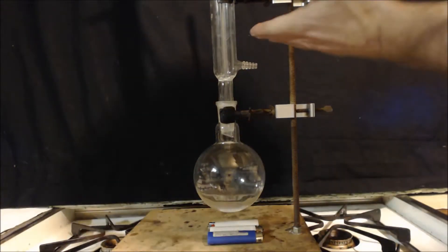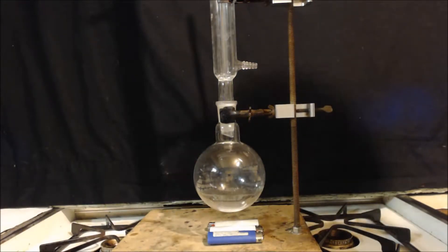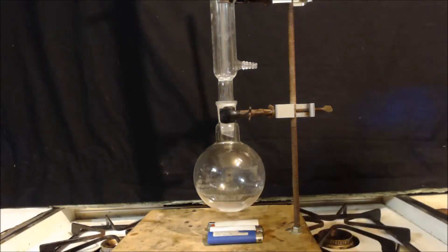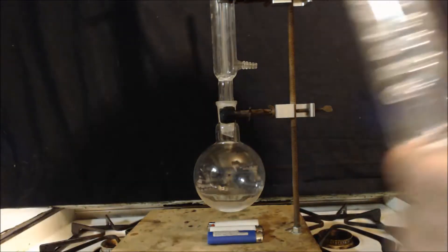Now for reflux you can use this type, I think it's called a Liebig condenser. But they do have a better one and it's actually made for refluxing where it has a coil inside.